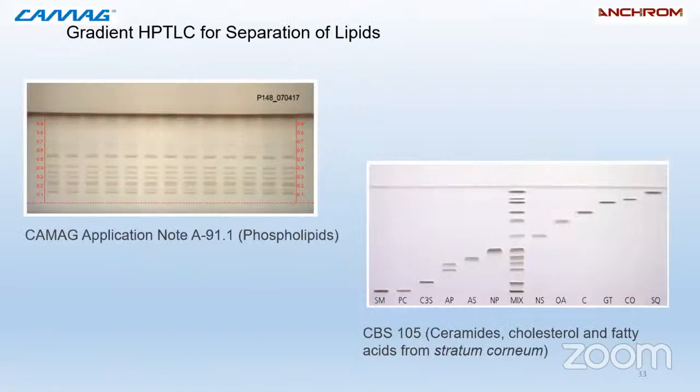This is one example of separation of phospholipids and ceramides, cholesterol, and fatty acids from stratum corneum of human skin by using this technique, AMD2. For more details, you can refer to these application notes.